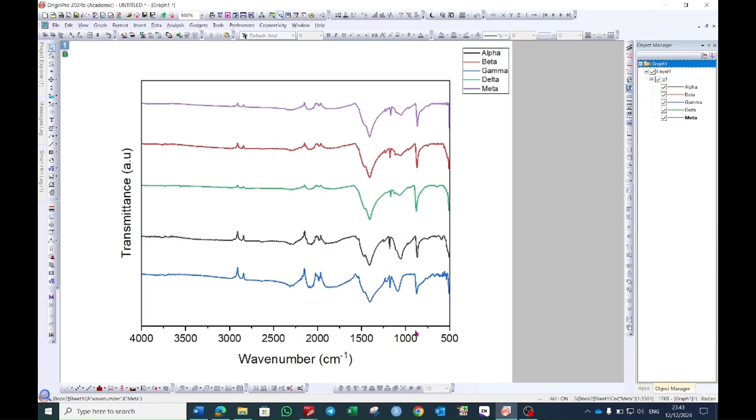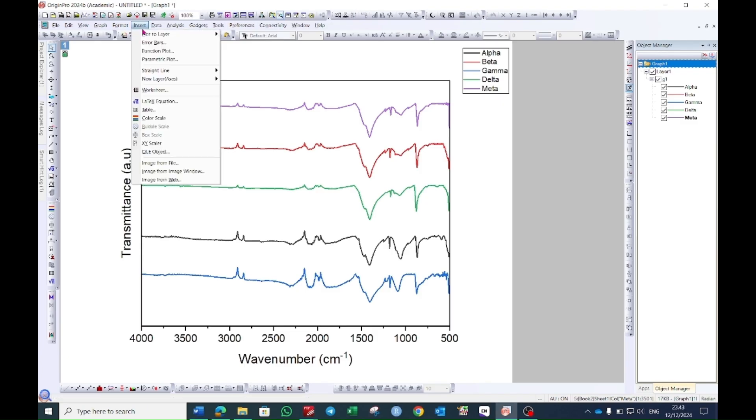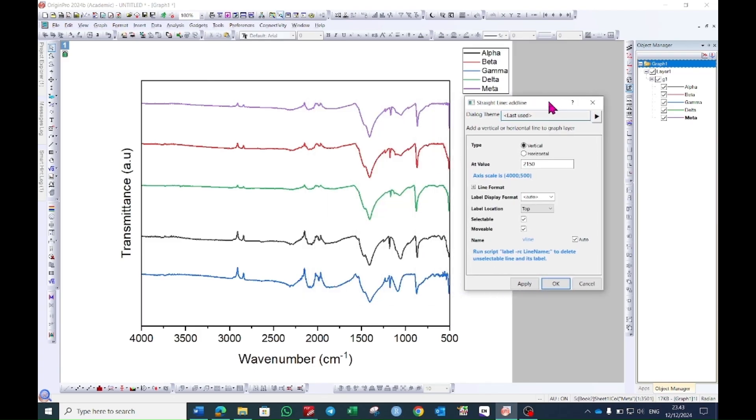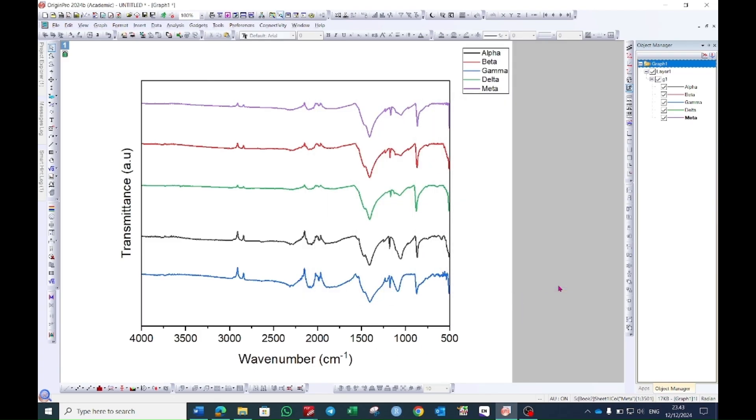Now if you want to show particular peaks, go to the insert option. Here you will see an option straight line. Select open dialog. You have to put the values of the peaks which you want to show. For example, I want to show a peak at 1821, 50.